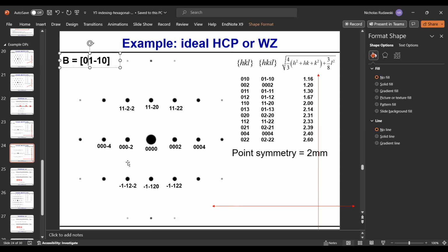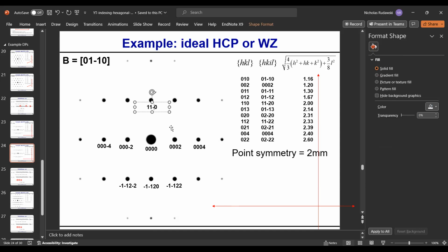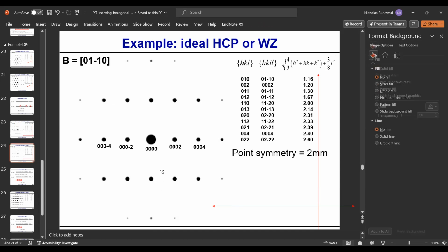I know for a fact that if I reassign these, these spots are all unaffected. These all still dot to 0. The problems are all these other ones, so let me go ahead and delete these. We stipulated this was G1 and G2, and we have to figure out what we're going to reassign for G2. We know this is the zone axis, the out of page direction.